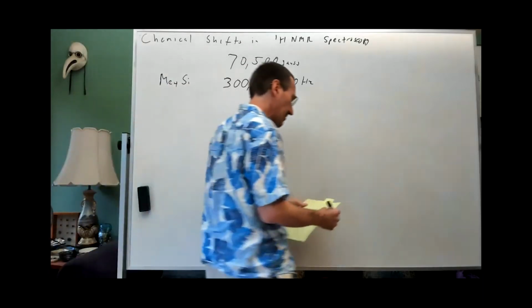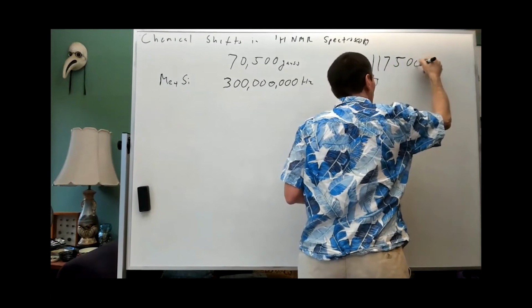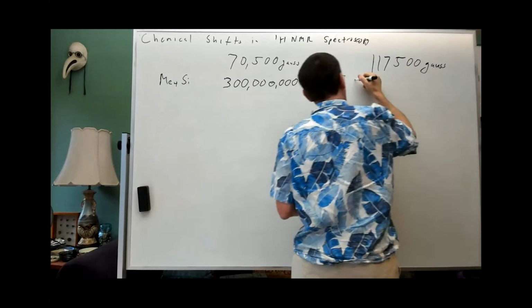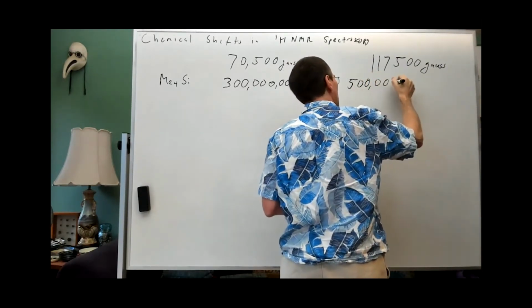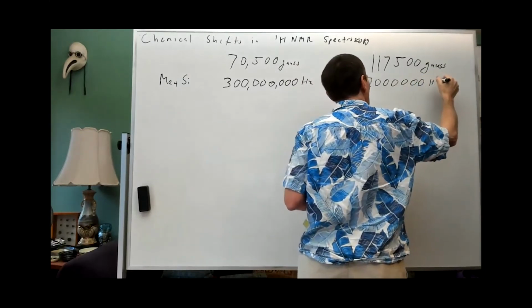So at 117,500 Gauss, that frequency now becomes 500 million hertz, 500 megahertz.